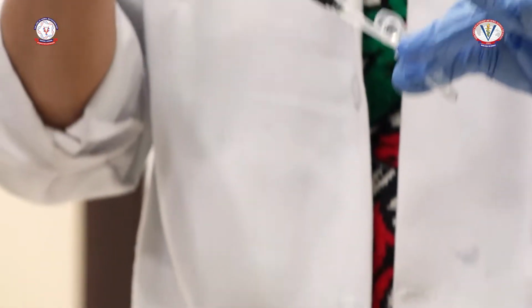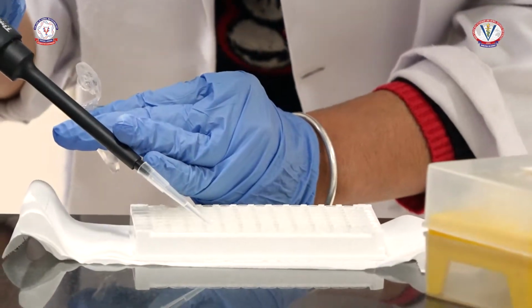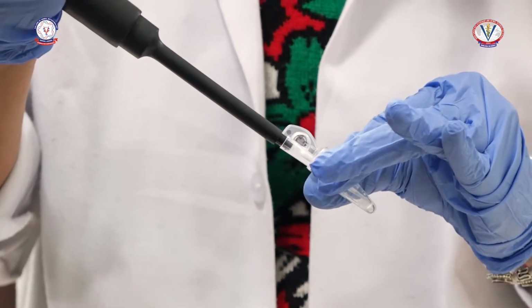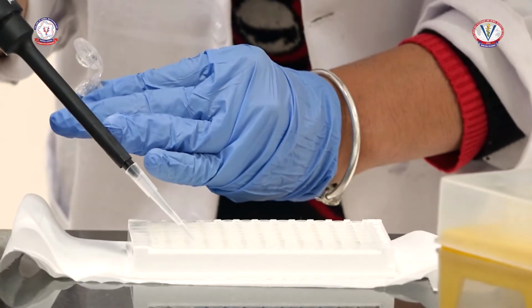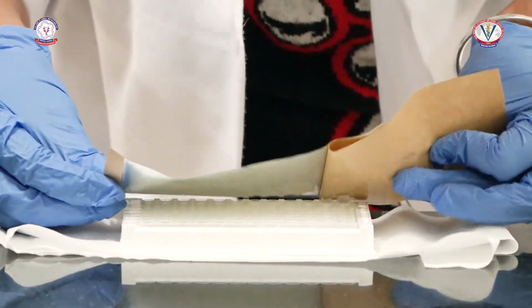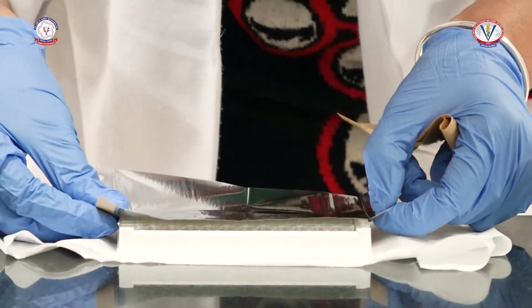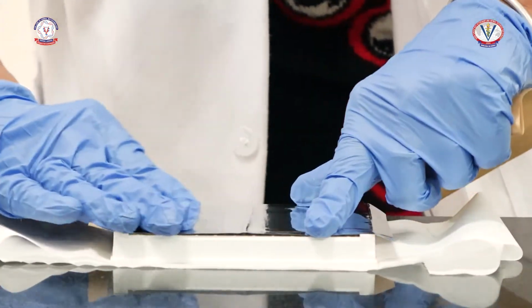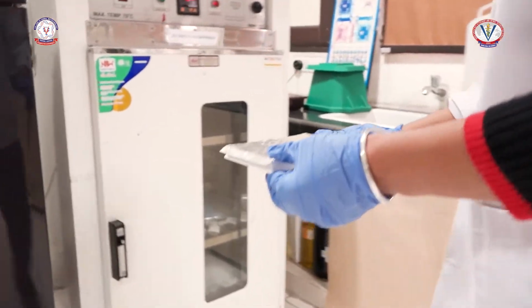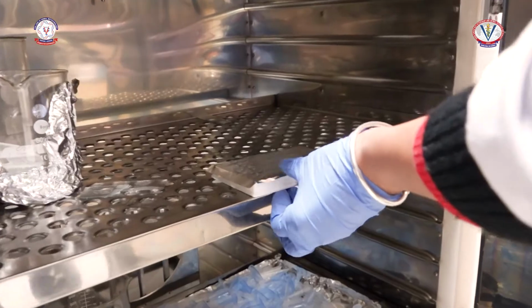If the antigen to be measured is smaller in size or has only one epitope for antibody binding, a competitive ELISA is used in which either the antigen is labeled that competes for the unlabeled antigen-antibody complex formation, or the antibody is labeled which competes for the bound antigen in the sample. Each of these modified techniques of ELISA can be used for qualitative and quantitative purposes.